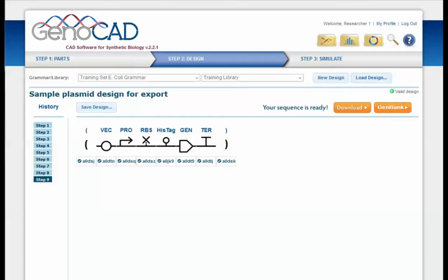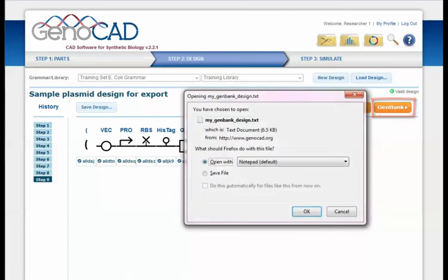And there's a couple of easy ways to do that. You could just quickly get the sequence information from the download button here, but if I choose the GenBank option instead, all of the GenBank features that are attached to my categories will come with the download file, and I can visualize those in other software. So that's the goal of what we're going to do today. So you would click the GenBank option here to download this.